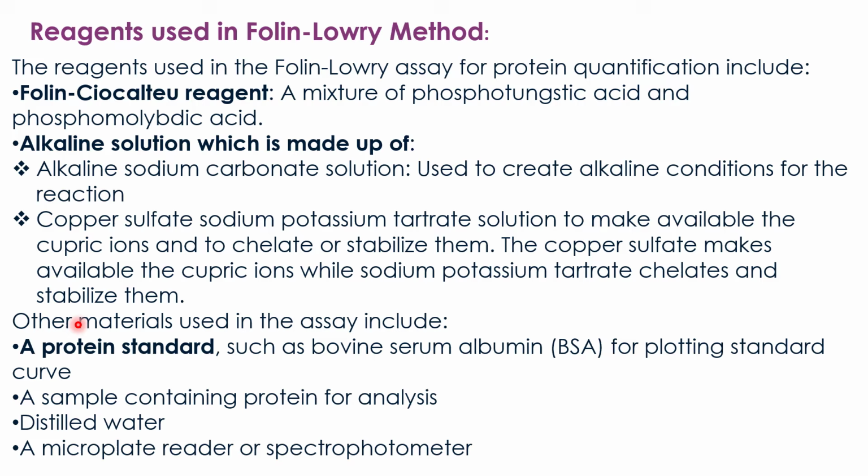Other materials used in the Folin-Lowry assay include a protein standard such as bovine serum albumin for plotting a standard or calibration curve, a test sample containing protein for analysis, distilled water for dilution, and a microplate reader or spectrophotometer for absorbance reading.